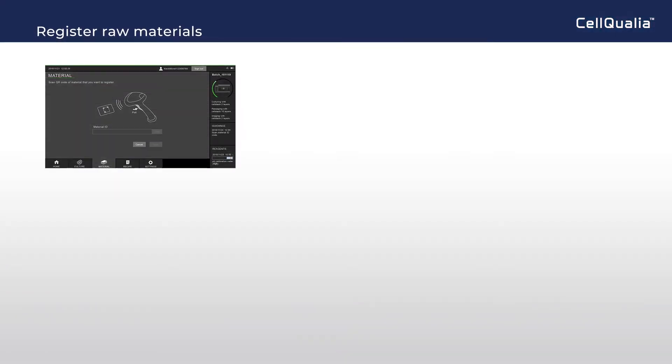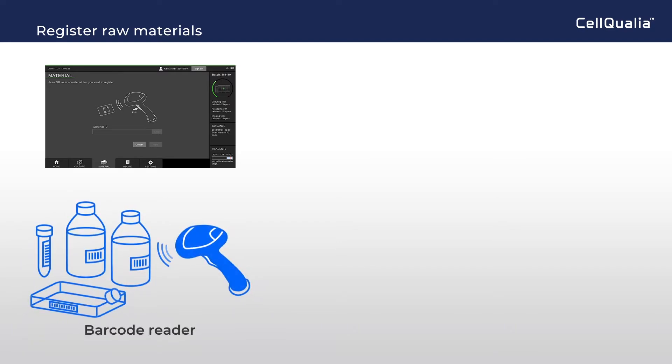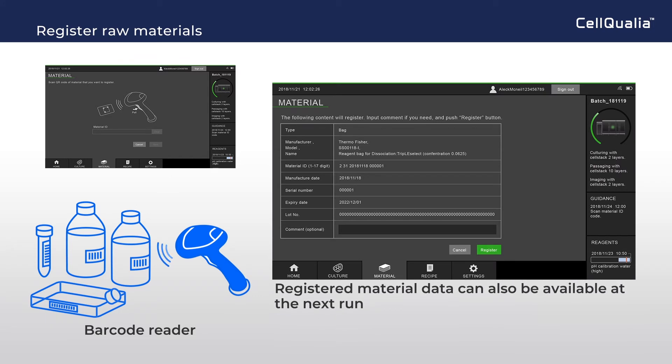All records, including raw materials, are highly preferred to be digitized. This system can register raw materials by scanning barcodes with a reader as a preparation for cell manufacturing. Registered material data can also be available at the next run, like a database.